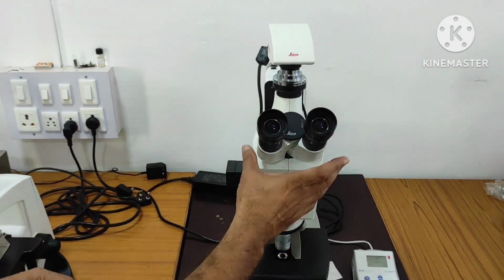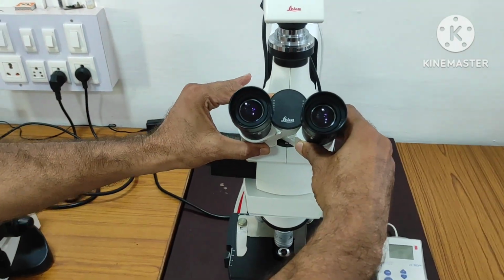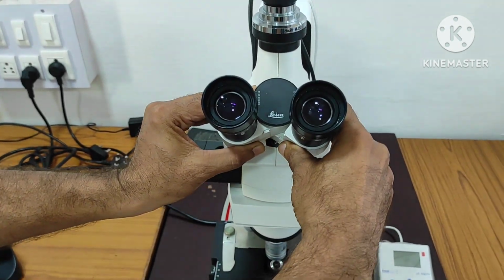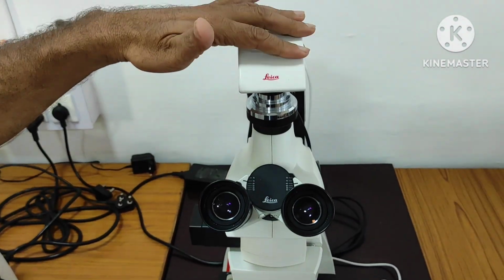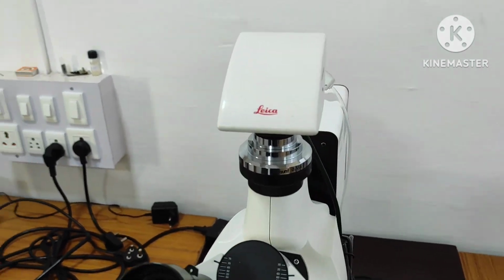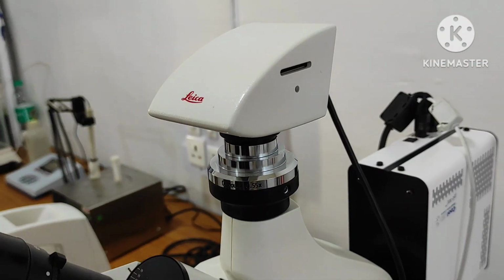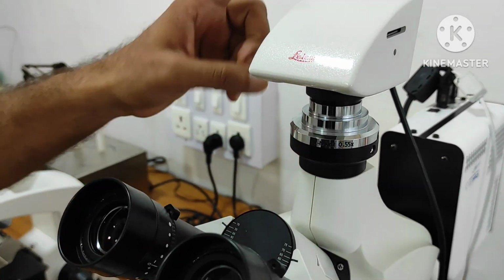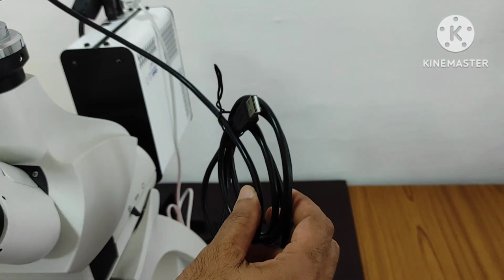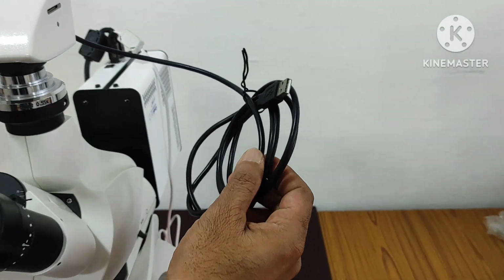Here you can see these are the binoculars, right? We can adjust them based on our eyes only, right? And that is having one very good camera, right? So whatever we are observing on the slide, we can capture photographs here, and this is connected with the system, we can connect it with either a laptop or desktop system.